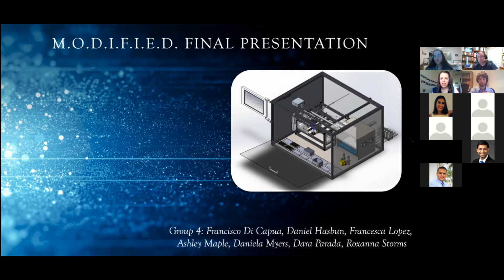Yes, it is running. We didn't analyze that, but we didn't think it would be an issue based on the materials we selected. The carriage that it runs on is proportionally a lot larger than the liquid handling and the claw, so we don't think that large stresses will be created there. And it's attached pretty strongly in that area as well, so we don't think that will be an issue.